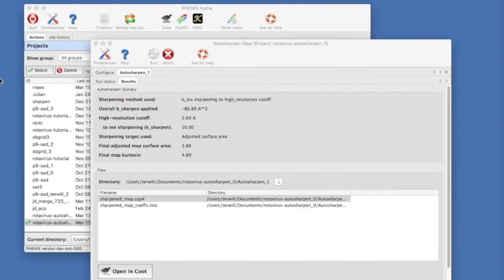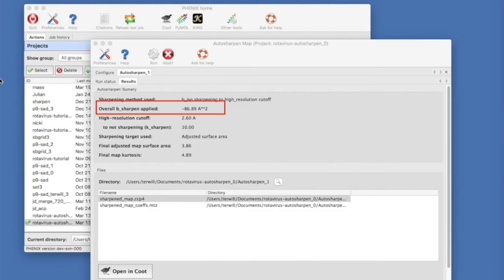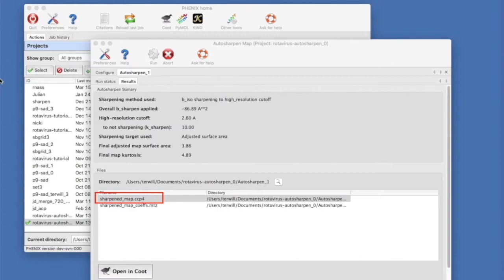At the end of the run, a summary is presented. It lists the final sharpening B applied of minus 86. It lists the file containing the sharpened map as well.